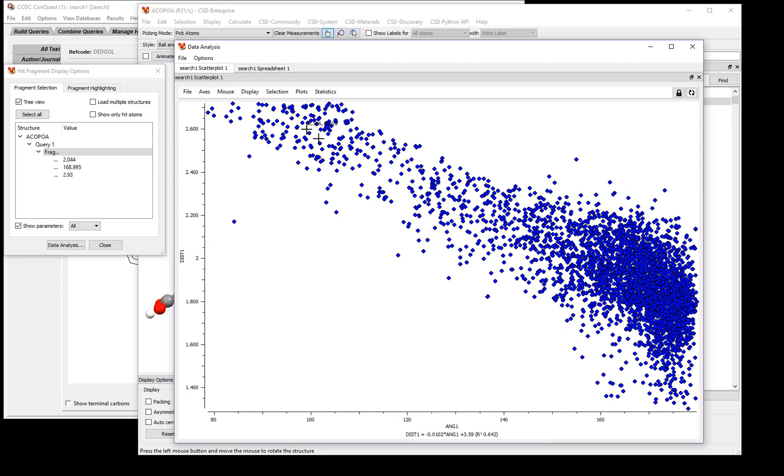As you can see, there's a nice trend in the data, such that the larger of the angle, the shorter the distance between the hydrogen and the acceptor.